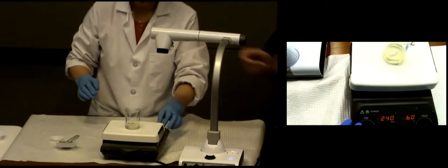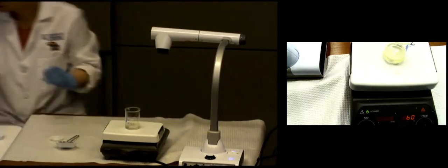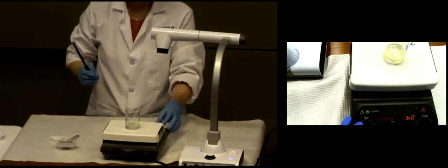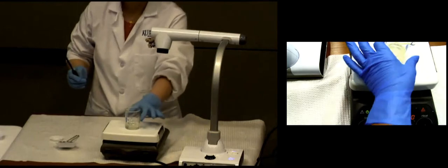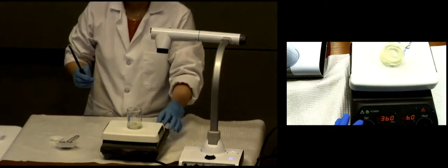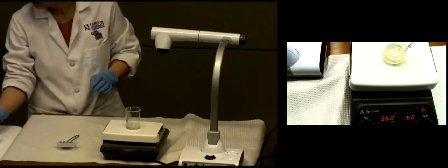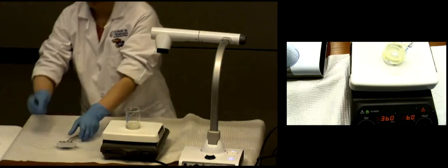So you want to talk about the numbers on the different hot plates? I haven't done that yet. Okay, so you can tell here, some of you have hot plates that look just like that, where you turn the dials and it has numbers. Some of you have slightly older ones that just have like 0 to 10. So that's why, in the procedure, it will give you either a number setting, like 4 or 5, or it might give you 60 or a larger number. It depends on which hot plate you have. They both work just fine, but that's why the settings may have different numbers.